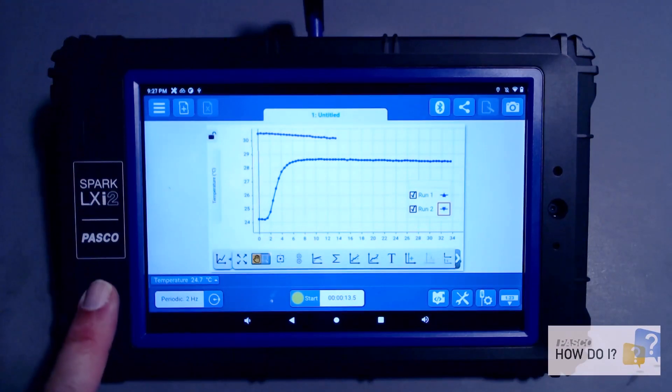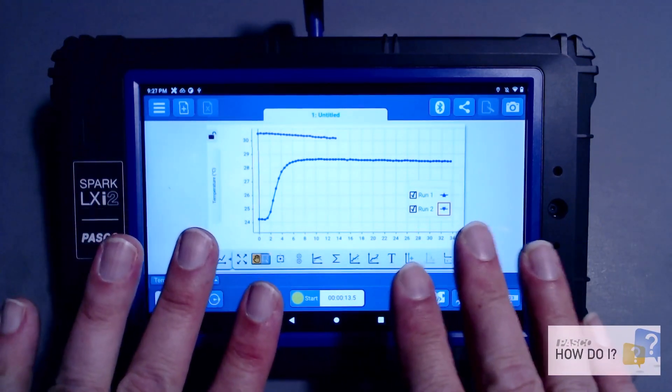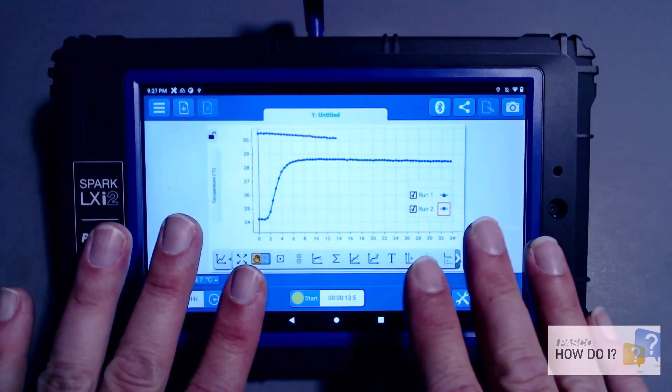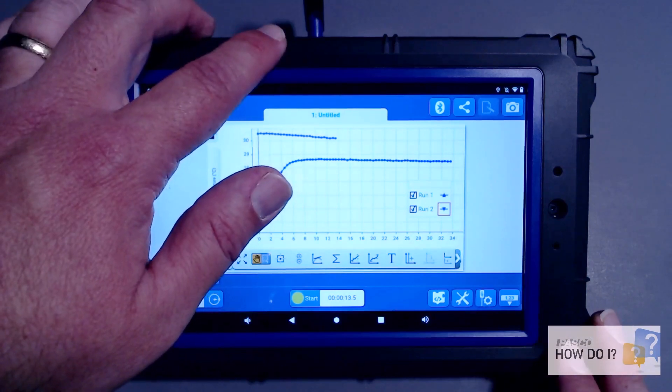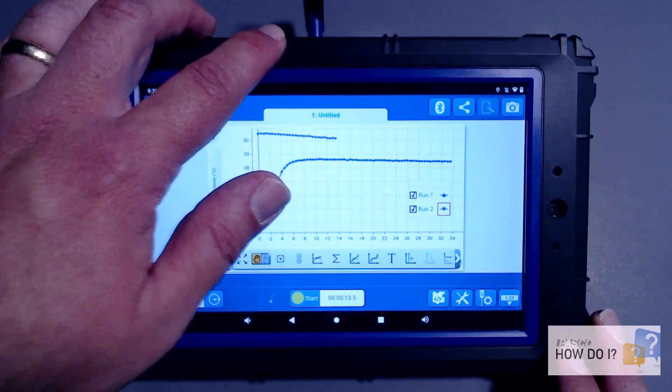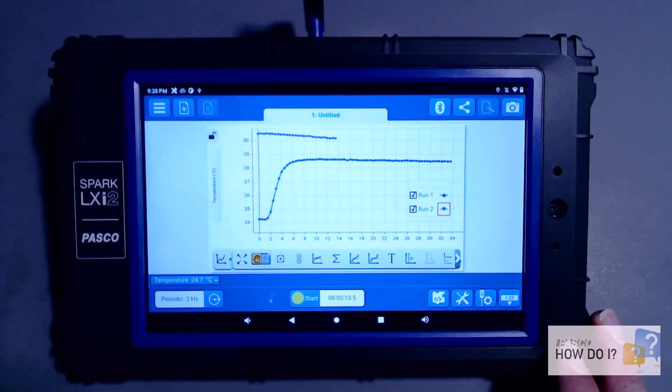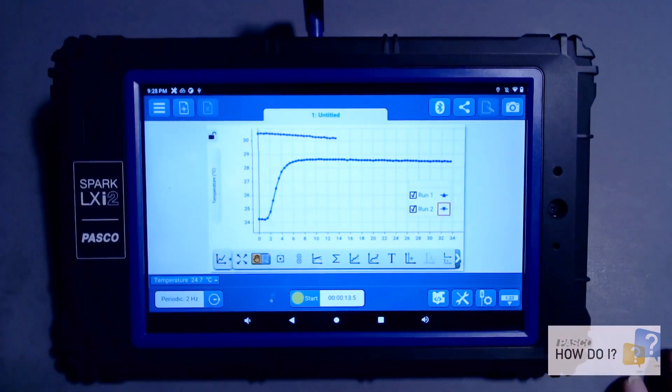On the Spark LX-i2, how do I capture an image of my Spark View displays and copy that to my USB flash drive to transfer to another computing device to, say, write a report?